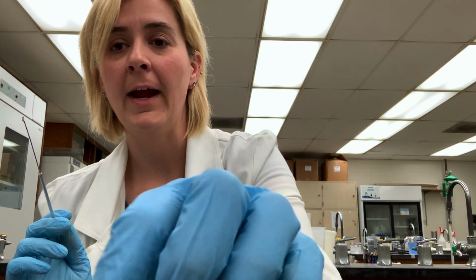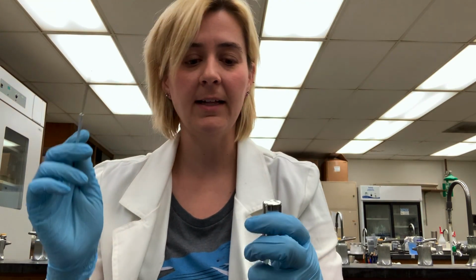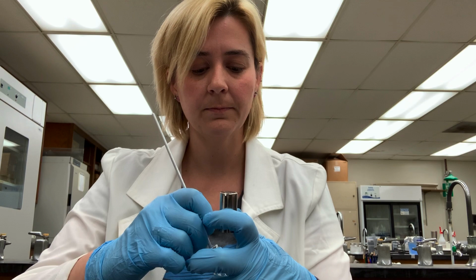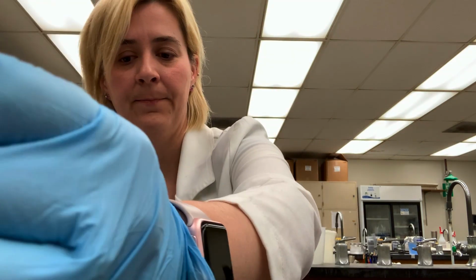So for our Gram negative, I'm going to go ahead and use Klebsiella. I've sterilized my loop. Okay, I've got a loop full of Klebsiella. I'm going to go ahead and streak that out in a spot on my slide, and I'll allow it to air dry. I'll sterilize my loop.